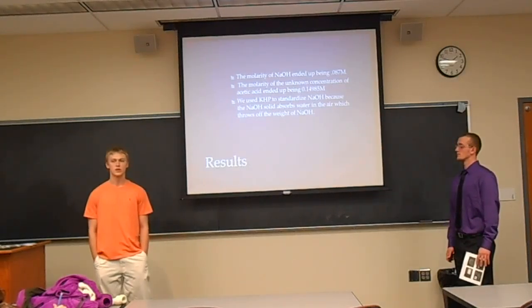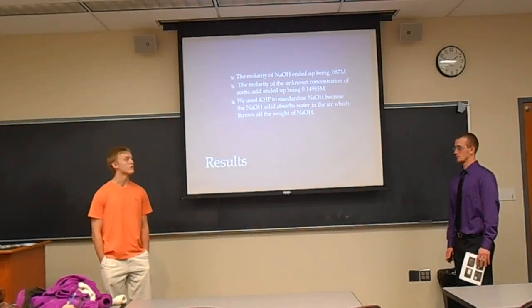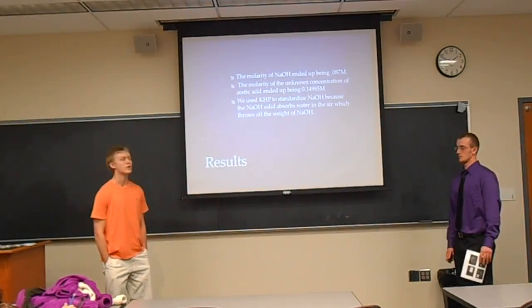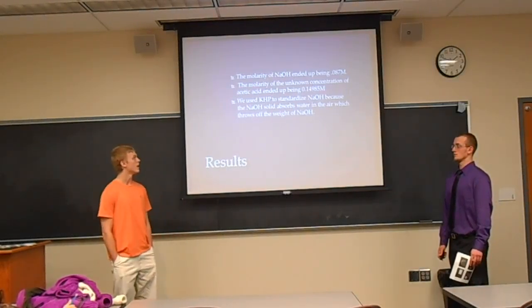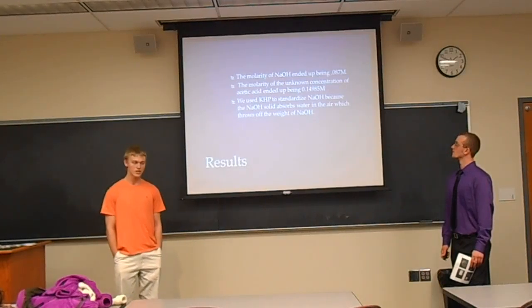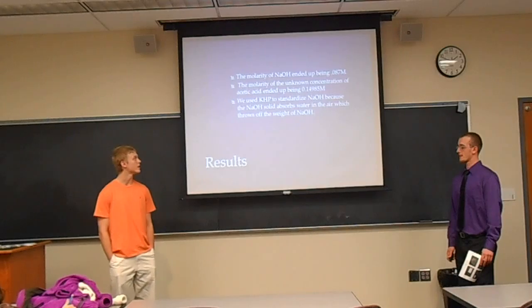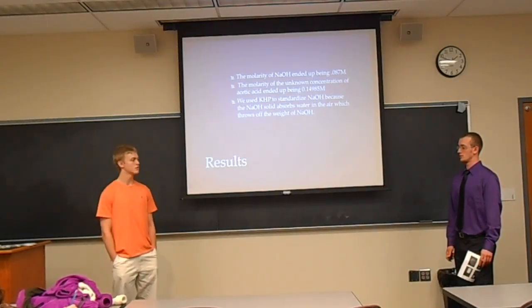One of the questions in our discussion questions was why did we use KHP? And we use KHP to standardize NaOH because the NaOH does absorb the water from the air around it, and the KHP helps it to not absorb as much water from the air around it, making it much more accurate in our weights of the NaOH.